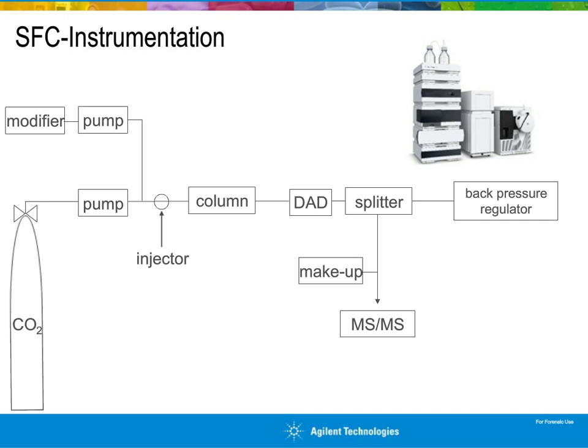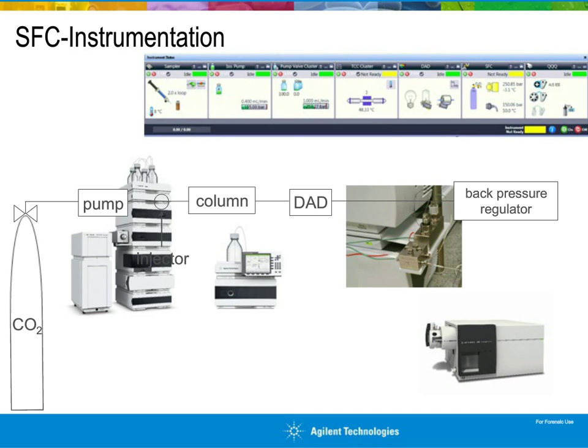If we look more at the instrument itself, you can see the pump for the CO2, the injector, and the column compartment, all integrated in that one system.